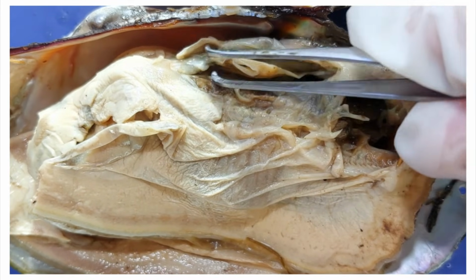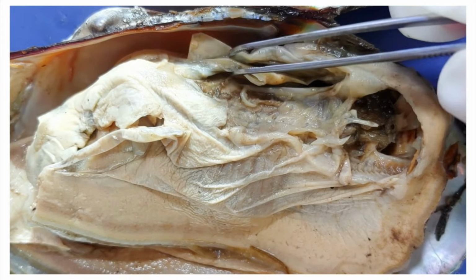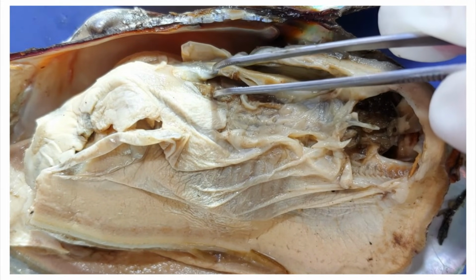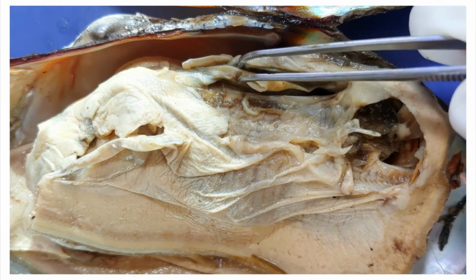Interestingly, you can also see this darker tube here, which is the intestine. And yes, the intestine passes partly through the heart in a clam. The way to a clam's heart is truly through its stomach.